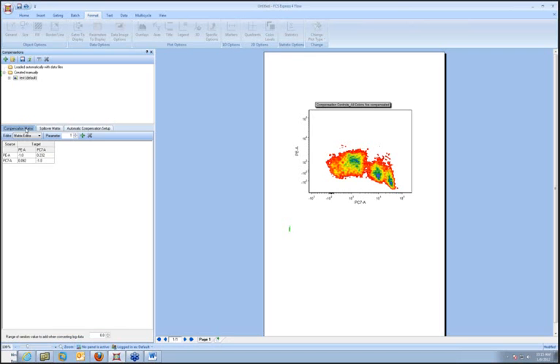One thing I would like to point out is that the matrices can be displayed in a grid form or in a form like some other software displays it, in a list, where you have percent of fluorochrome 1 minus percent of the other fluorochrome. Okay? So whichever way you prefer to see it, you can see it in a matrix view or in a list view. In any way, you can just simply type in values in here, and this is both with the compensation that you've created manually as well as automatically. Later on, I'll show you how to do that.